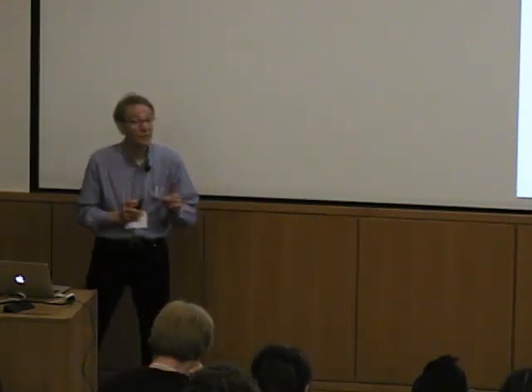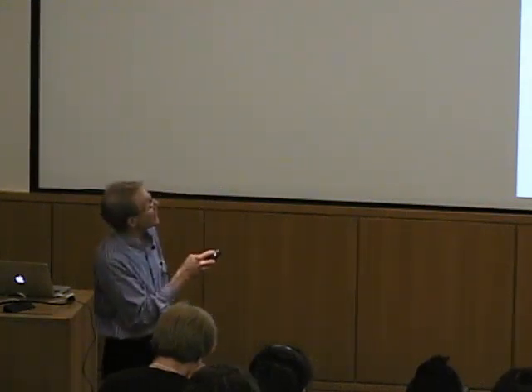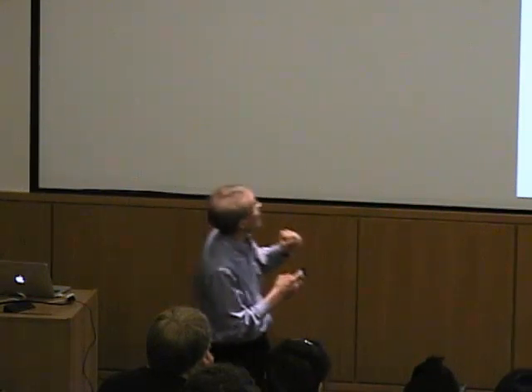So what we did was we fell back on a type of measurement that had worked successfully in some other cases. And that is to start with the metal-bound form and titrate in a chelate that extracts out the metal. And now you base your analysis on microscopic reversibility. Okay? Now, here's the data.